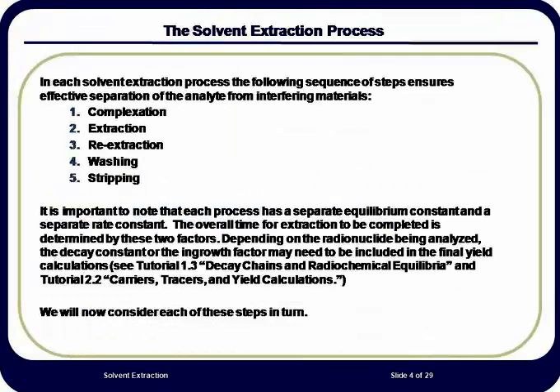In the second step, the equilibration process occurs by shaking the separatory funnel. Unless otherwise specifically noted in a particular method, the amount of time that the 2 phases are shaken during this step is about 2 minutes. The initial organic phase is separated and set aside.